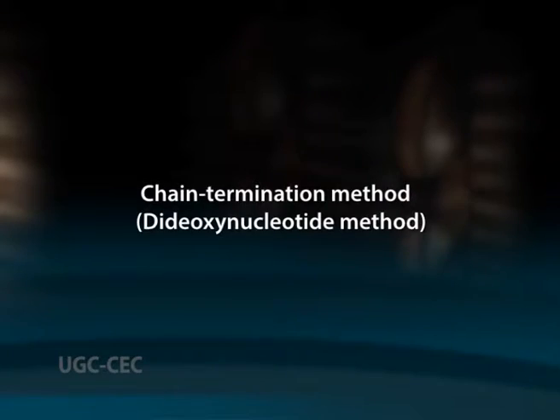Electrophoresis on acrylamide gels has been used to resolve the products generated by the polymerases. Due to the inefficacy of the plus and minus method, Sanger and his co-workers described a new breakthrough method for sequencing oligonucleotides via enzymatic polymerization. This method was initially known as the chain termination method or the dideoxynucleotide method.